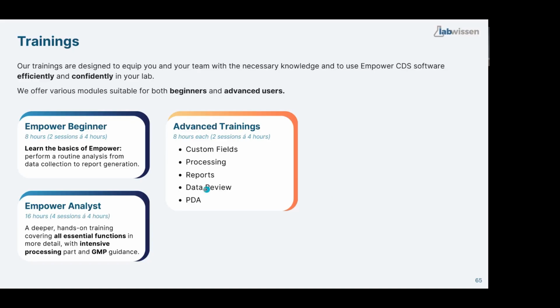Then data review. For GMP, how we work with audit trails, how we work with view filters, where we find manual integration and how we work with it. And PDA, if you're working with 3D data, with spectra, with library searching, purity of spectra, that's it.